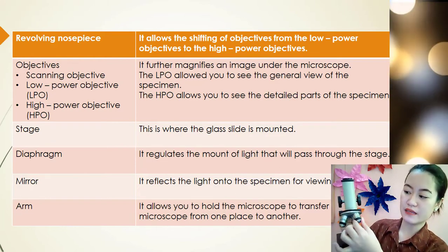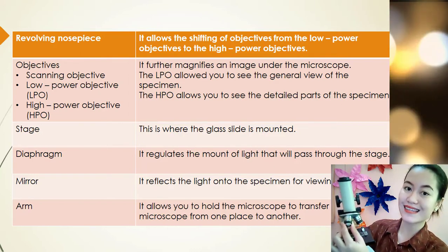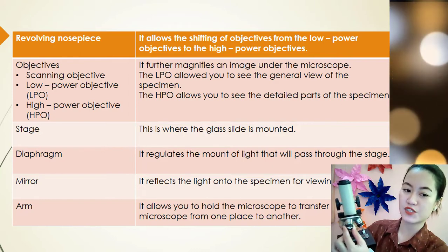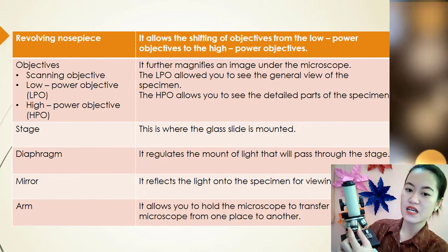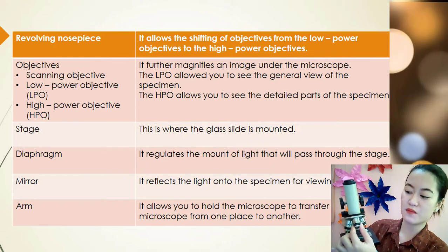Next, how about the low power objectives? So this is the low power objectives. 10 times naman yung kanyang magnification, or the LPO. So the LPO allows you to see the general view of the specimen.